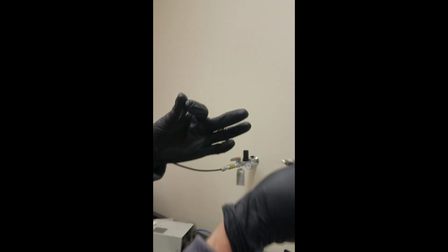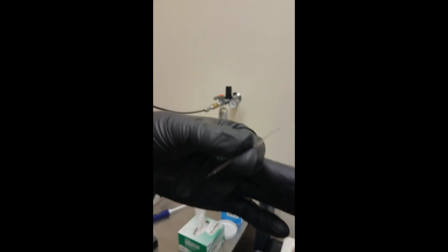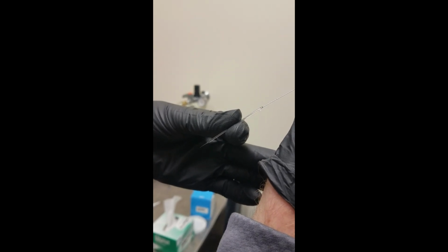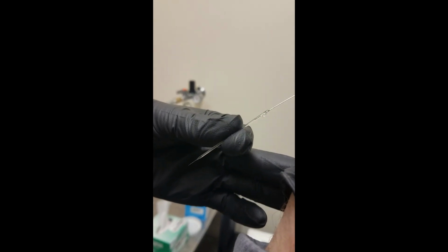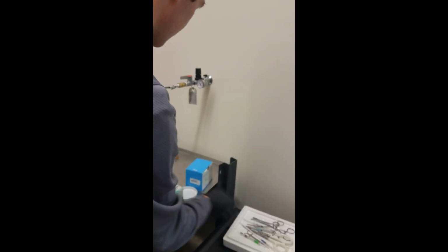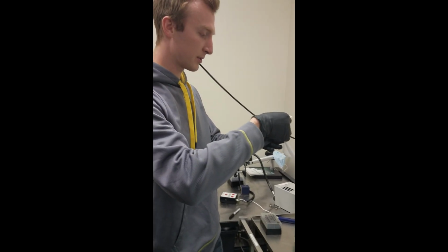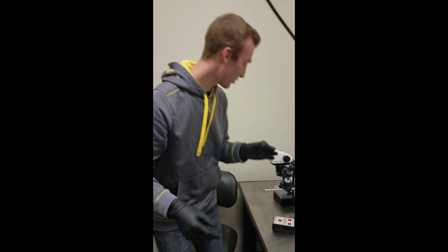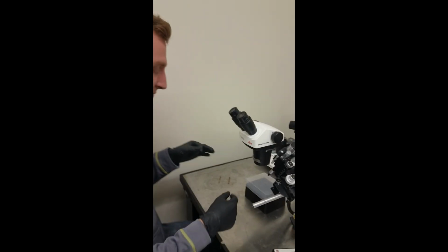And see, I got a little bubble in there. There's still a little bubble in there, so I have to get that bubble out. So I'm just gonna poke the needle back in underneath the bubble, and then put in some more oil until the bubble comes out the top. Okay, now this is ready. I'm just gonna dry it off. We're gonna take it over here, and we're gonna put it on this machine.